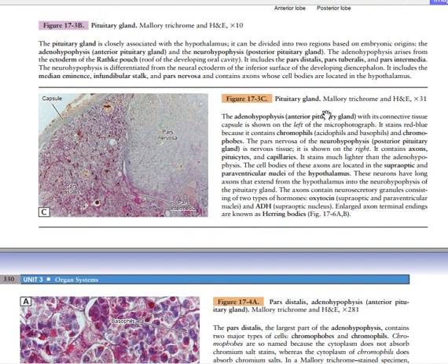The next thing is still on the pituitary gland. Now you need to know that generally what we use in order to visualize the pituitary gland is the Mallory trichrome stain. I also use the hematoxylin stain. This Mallory trichrome stain is very important in order to name the cells of the pituitary gland, either chromophobes or chromophils. Chromophils are the cells that are going to absorb the Mallory stain. Trichrome is because it is made up of chromium salts. Is it clear? It is called Mallory trichrome, and that trichrome comes from the derivative of the chromium salt.